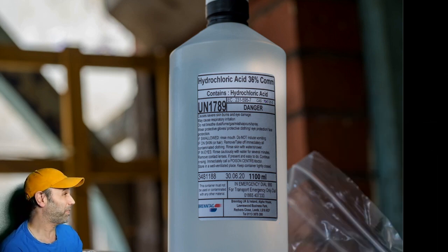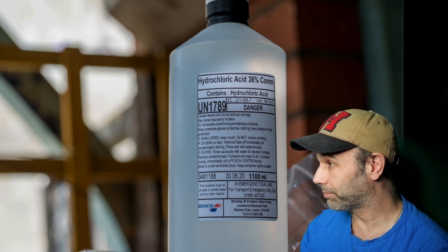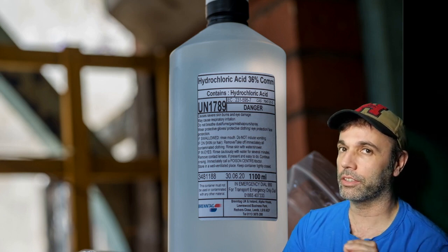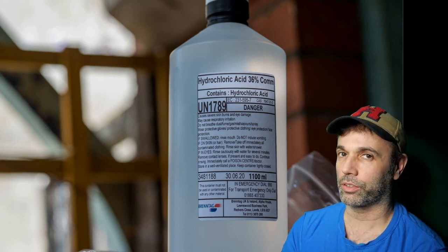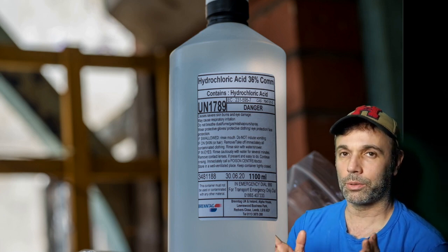Could it be maybe 36% of a mole — so 0.36 mole? No, that's not right, but it is confusing. This is actually hydrochloric acid which is 36% hydrogen chloride by mass. That means 36% of its mass is hydrogen chloride and the rest is water.